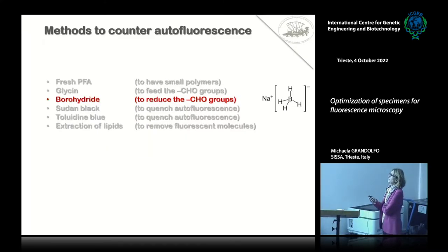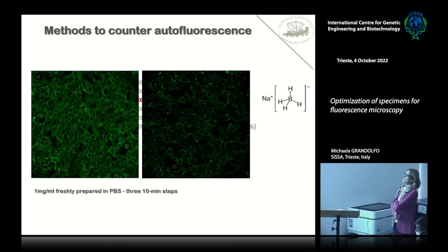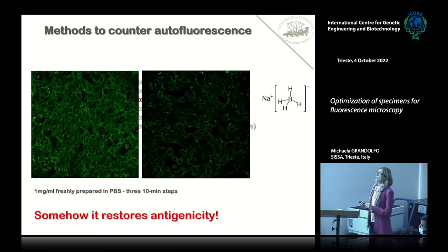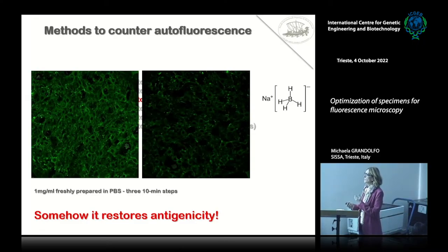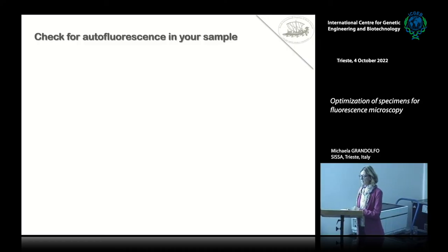I want to spend a few words on sodium borohydride because it is a very nice strategy to reduce background. Here is a section before treatment with sodium borohydride and this is after — a dramatic improvement. There is another advantage: sodium borohydride is also able to restore antigenicity, so it is an unmasking step that can help you to see your antigen better, or to see it at all if you weren't able to before.